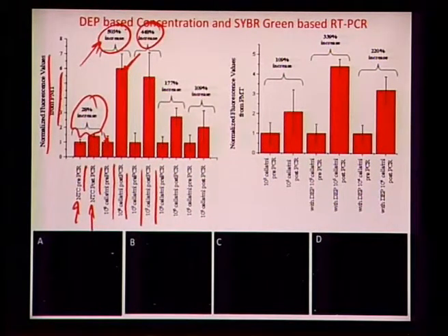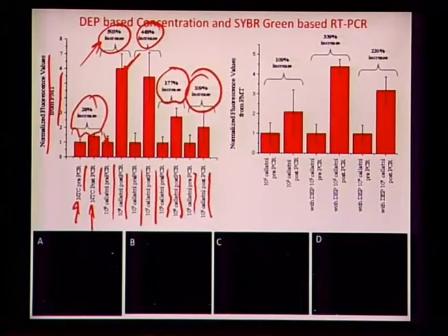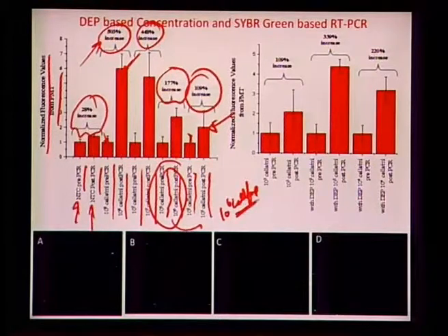448% growth. Okay, this comes down further when it goes to 10 to the power 6 cells, it comes to about 177% increase, and for 10 to the power 5 cells per mil again it comes to as low as 109% increase, but you see here the error bars of both the processes are more or less within each other. So, this is not really a good data point, and we can say that for this microchip 10 to the power 6 cells per mil really is the kind of ultimate concentration which this chip can take up and amplify.